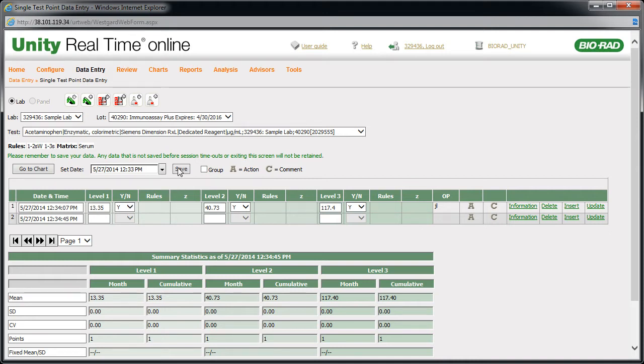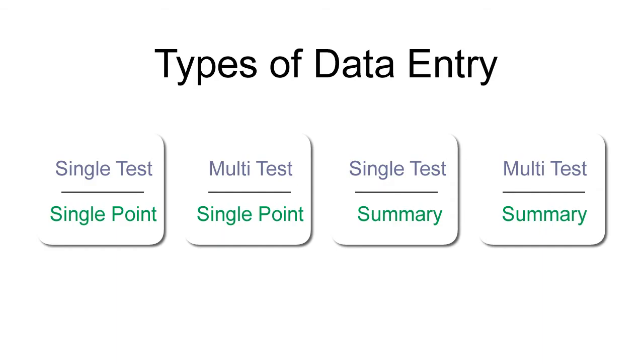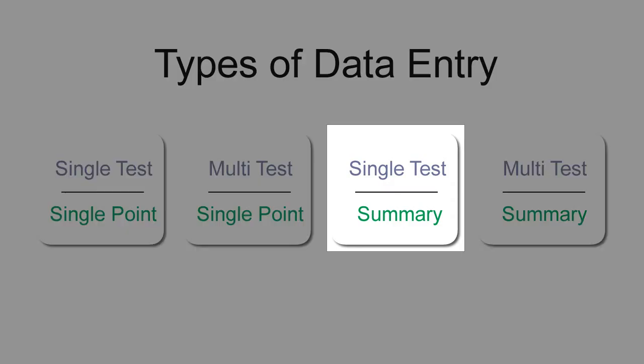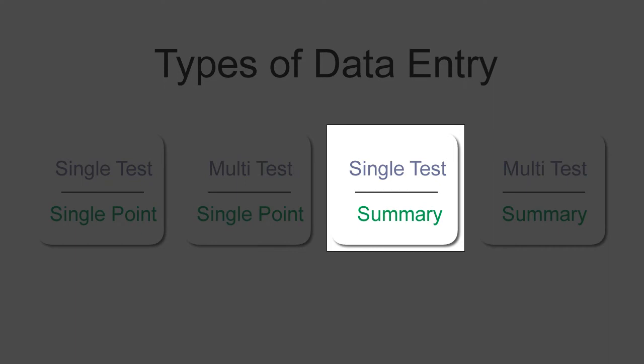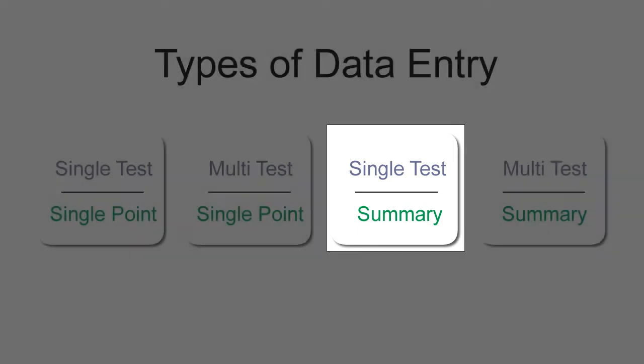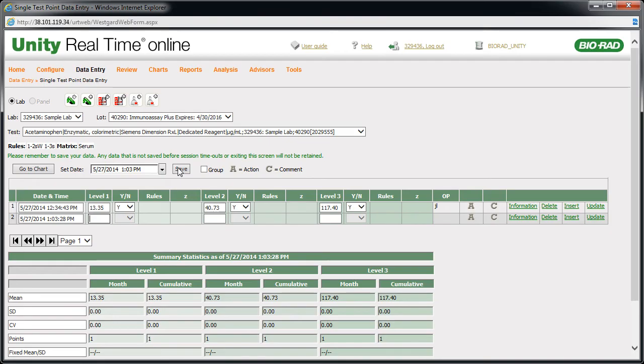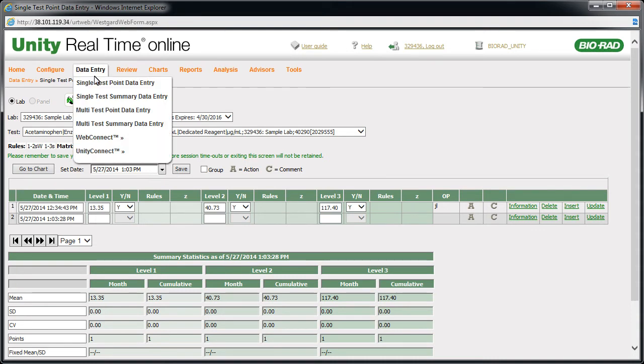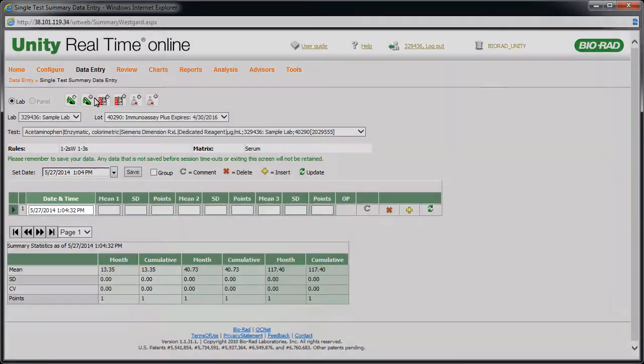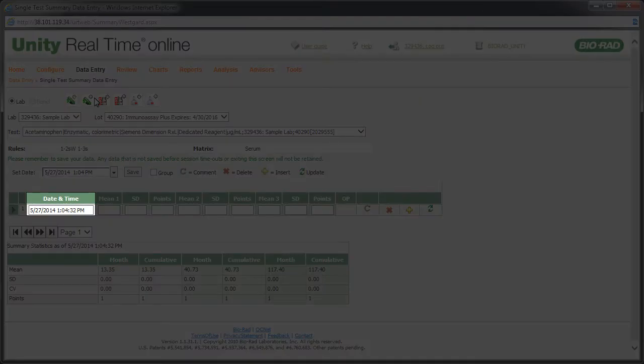click Save. Let's take a look at the next possible data entry method by returning to the screen where we left off. Point to data entry and click Single Test Summary Data Entry.